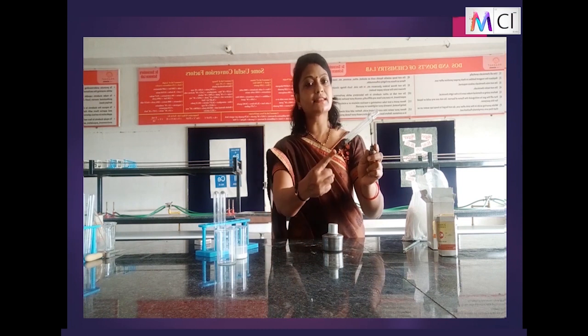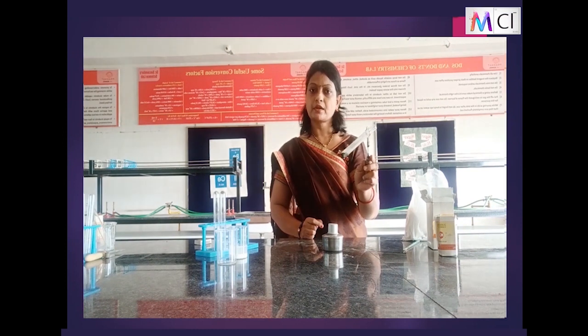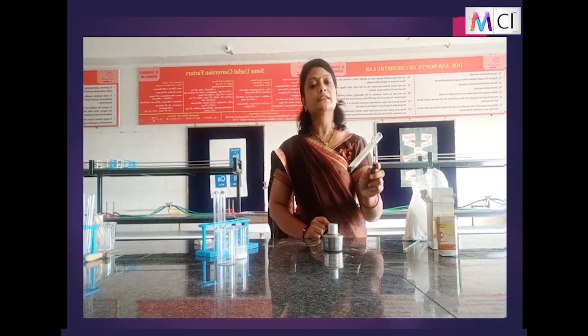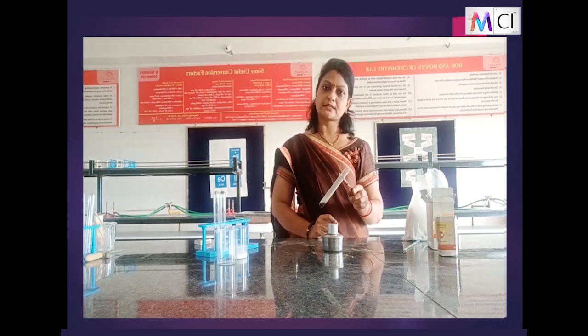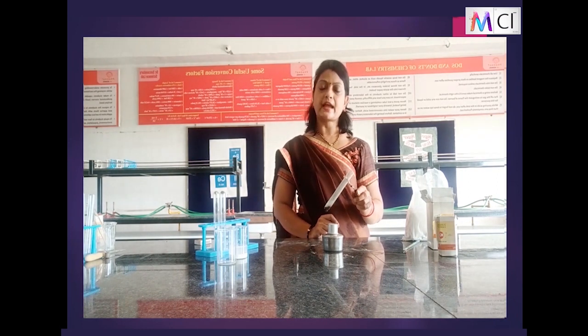So children, you observe a black colored compound is formed. This black colored compound is nothing but ferrous sulfide, that is FeS is formed. So Fe plus S, that is iron plus sulfur, gives FeS. Here also we observe that the two reactants combine to form a single product. So thus we can term it as a combination reaction.